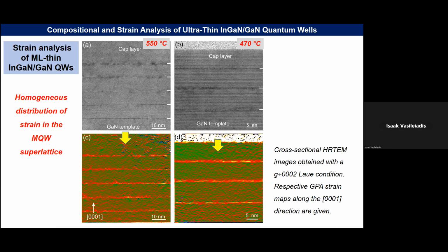But here we have to mention that the mask size is the parameter that defines the spatial resolution of this method.